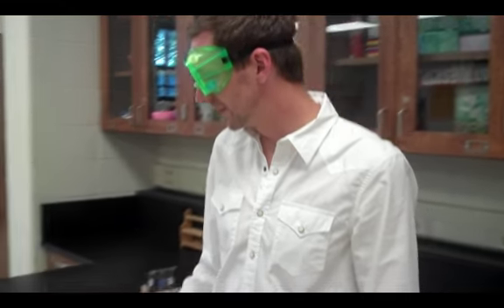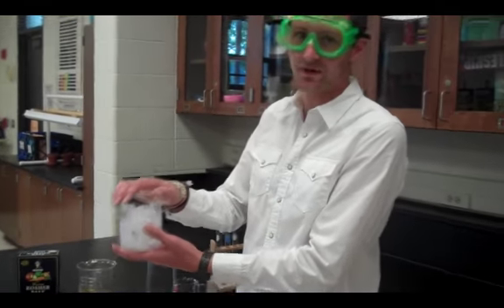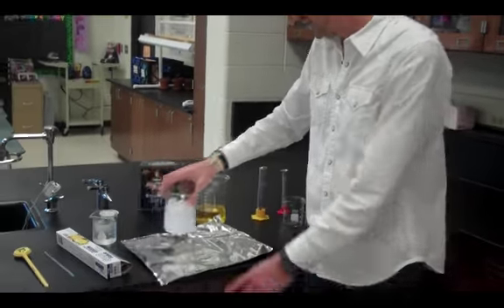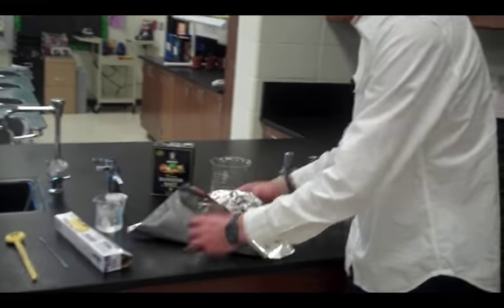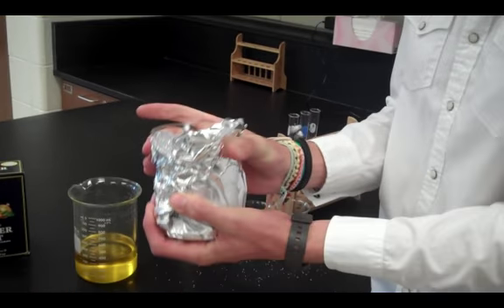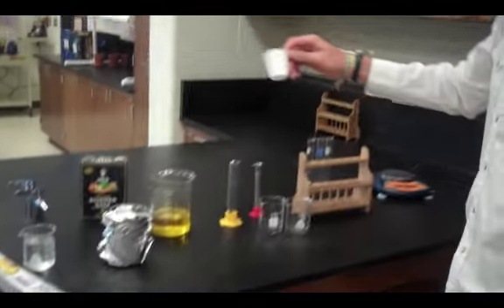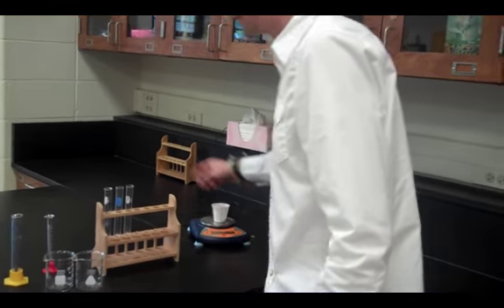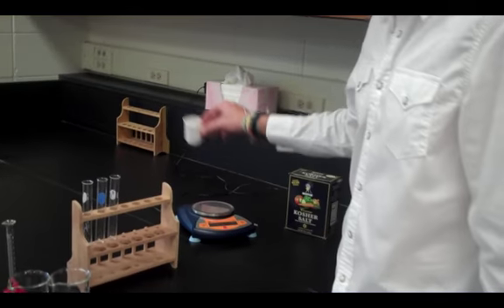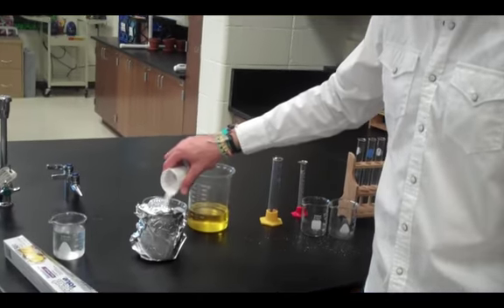So what you're going to want to do is first get your 600 milliliter beaker and fill it up with ice. And then you're going to cover that with tin foil for some insulation. And you're going to record 20 grams of salt. I actually already put it in there. So we have 20 grams of salt in here, and you're going to put it on your ice.